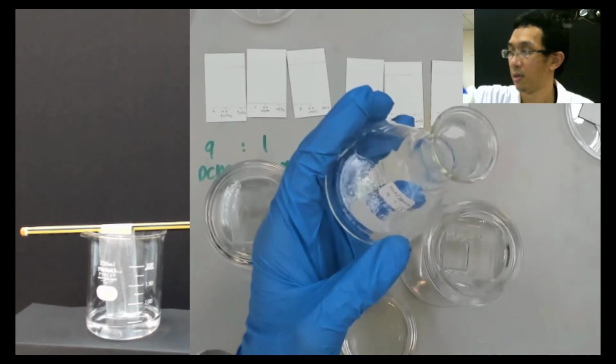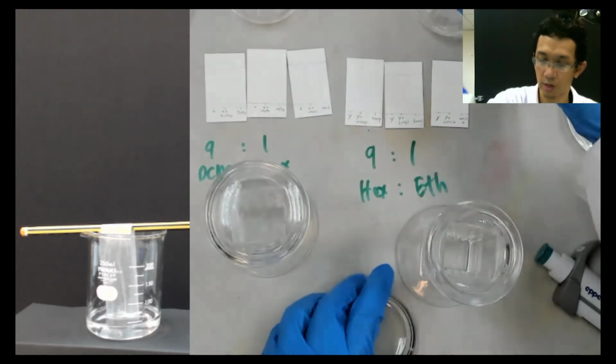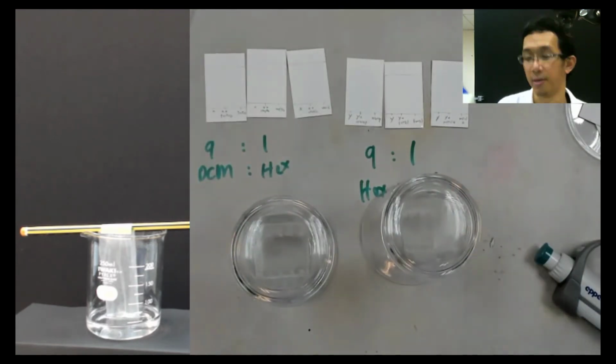Okay, so now we're done with that. So we close this thing. So now we're done with preparing the developing chamber.